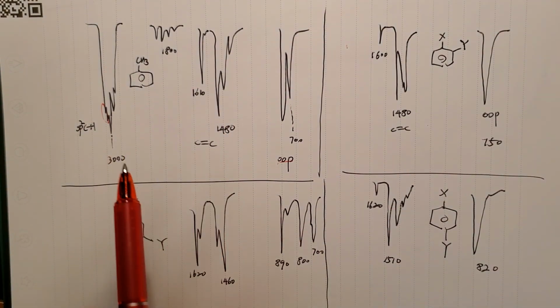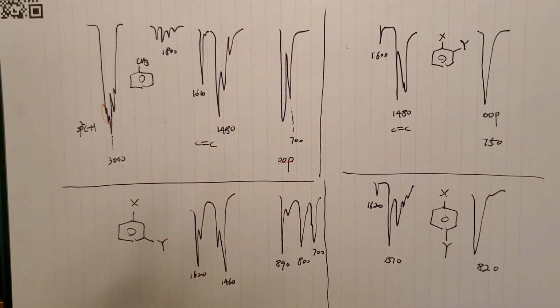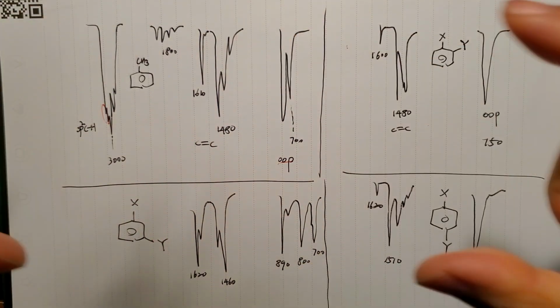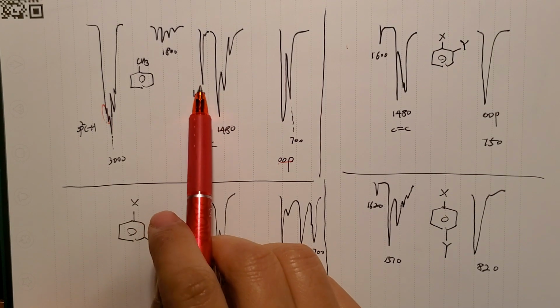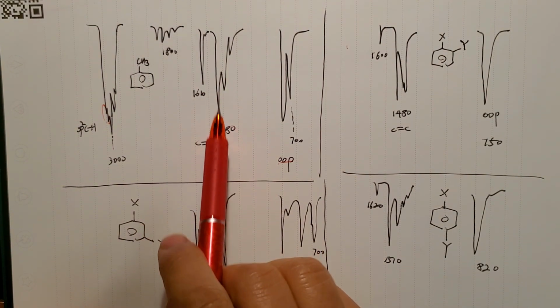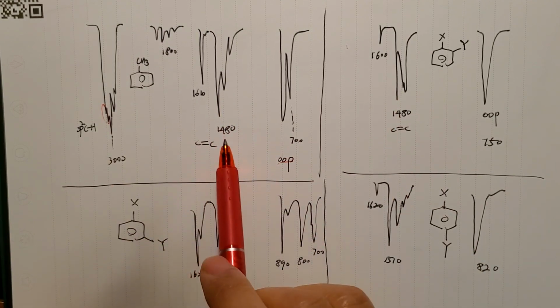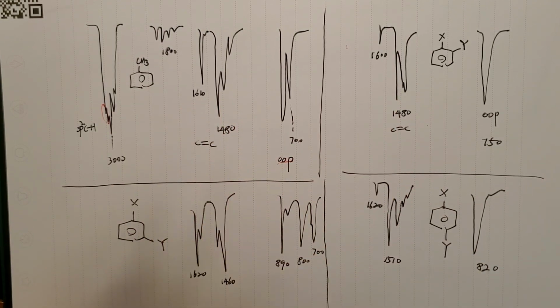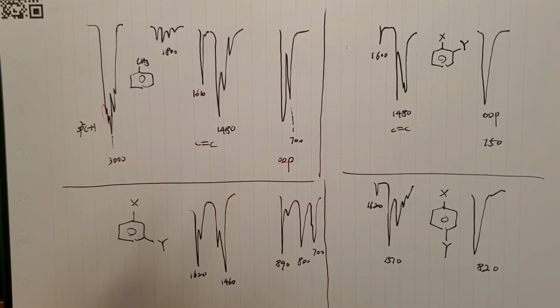So the double bond that you can see, the 1600 one, remember the 2 double bonds of the ring going in and out while the hydrogens are going opposite way, right? That one is weak. But other double bond stretchings are stronger at above 1450. So basically those 2 I showed you before. Relatively 1610 is weaker for mono, okay?